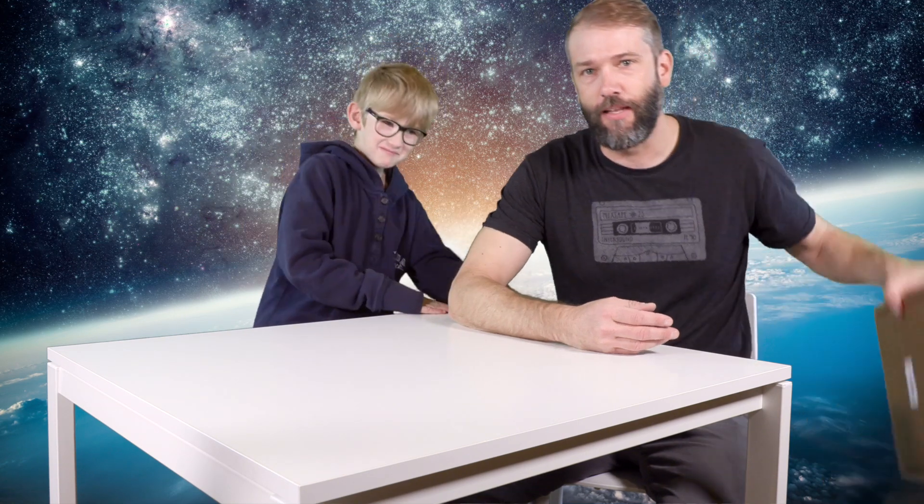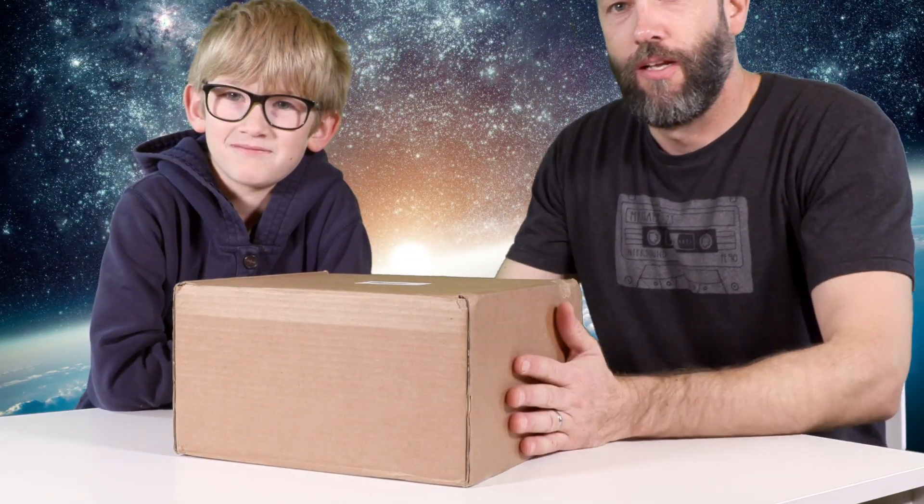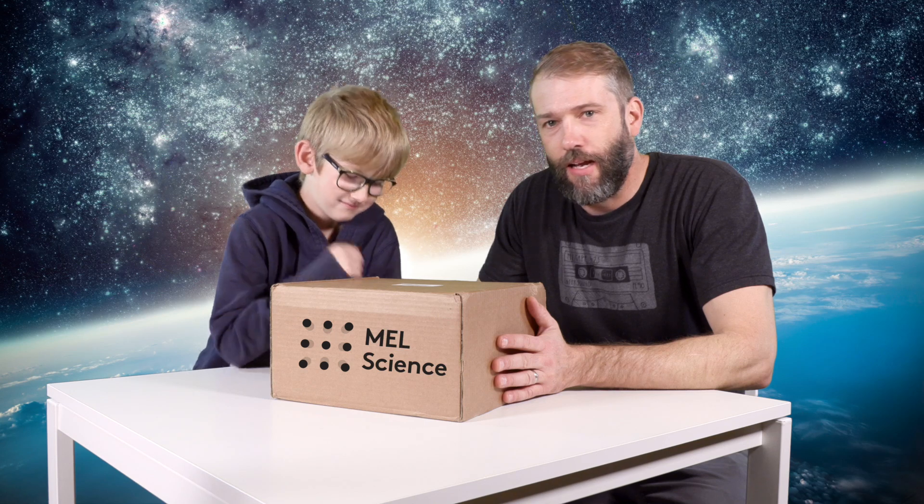We have something interesting to show you today, and it came in a brown box that looks like this. Inside this box is a science chemistry activity that was sent to us by M.E.L. Science. This is like a monthly subscription box thing that is popular, just like KiwiCrate, that's popular with homeschoolers and sort of active science families. They sent us this because they wanted to get our take on it and show you guys what's inside and how it all works.